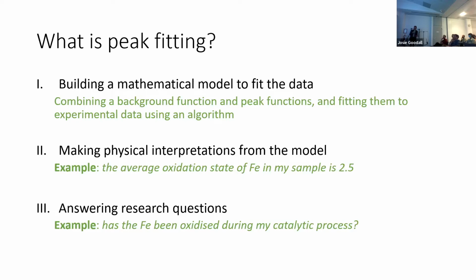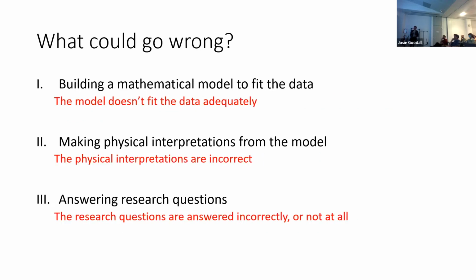So what could possibly go wrong? Well, that's the rest of the book. Some things can go wrong just with these 3 steps. Firstly, of course, the model doesn't fit the data adequately. For whatever reason, you mess up your fitting algorithm, you forget to press fit, it happens.